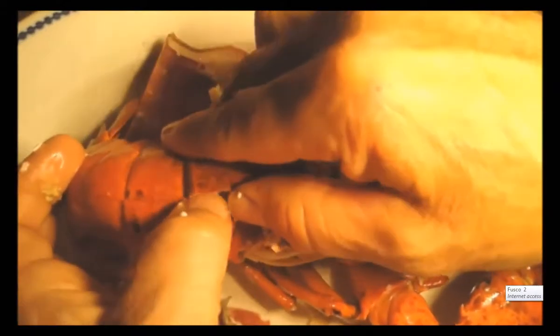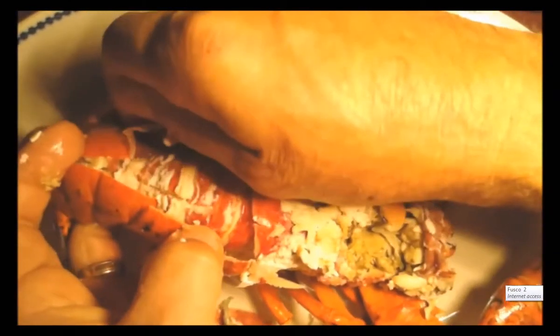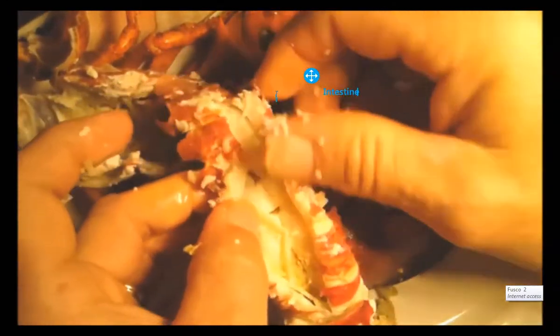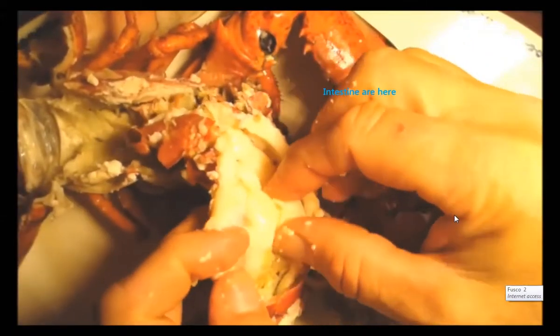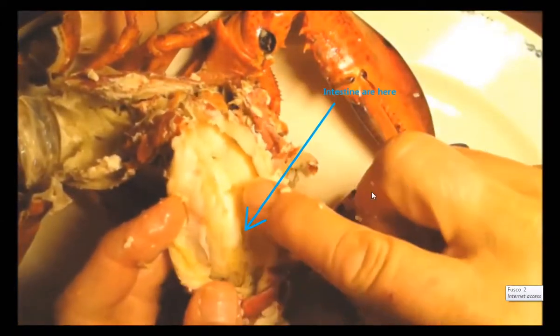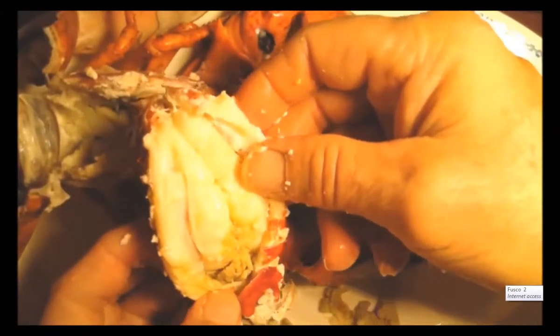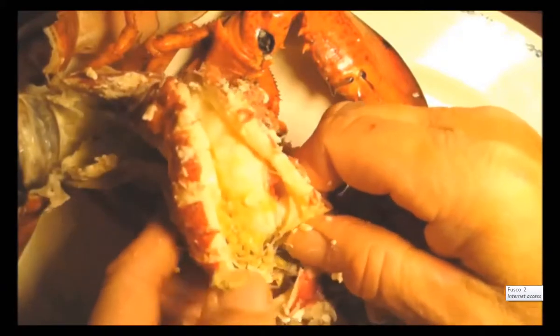I'm going to remove the shell from the tail here, and I just want to show you the intestinal tract of the lobster. Moving over here — this is the intestine, and this is actually the blood vessel of the lobster. That's the inside of the abdomen of the lobster, and here's the beginning of the intestine right here.